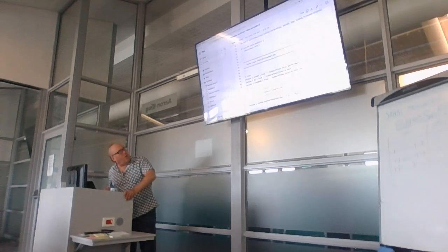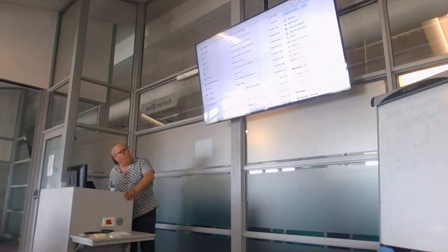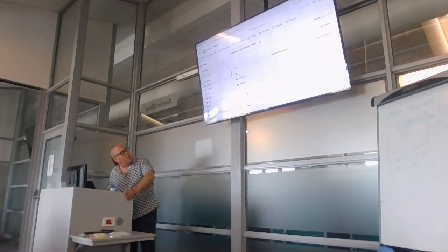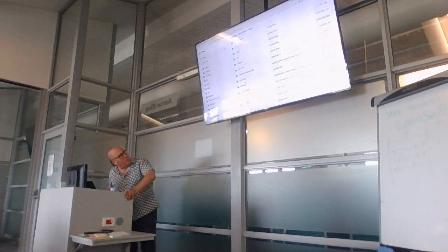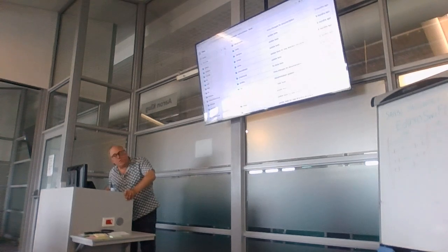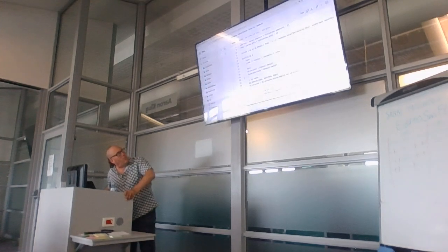Okay? So now, we saw that QC was imported from sub-workflows local QC. So if we go back into the main code, and we go find sub-workflows local, and there's so many of them, but we were looking for something called QC. Where's QC gone? There's QC. And then main. And then there's the workflow QC.